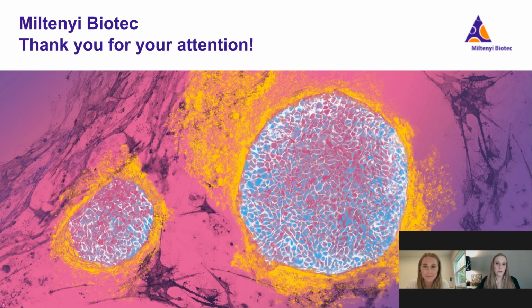Yeah, so that's a great question. Thinking about the MACSIQ View software, I think there's several ways that you could combine this with existing analysis pipelines. First, there's user-generated segmentation masks people have obviously worked on. You can import these into the software to identify the cells and then use the downstream tools that are built in.